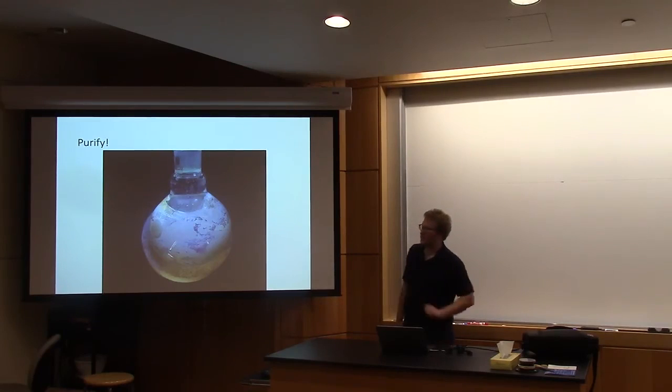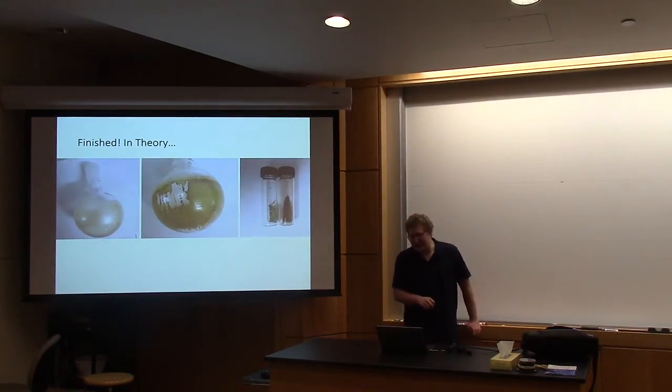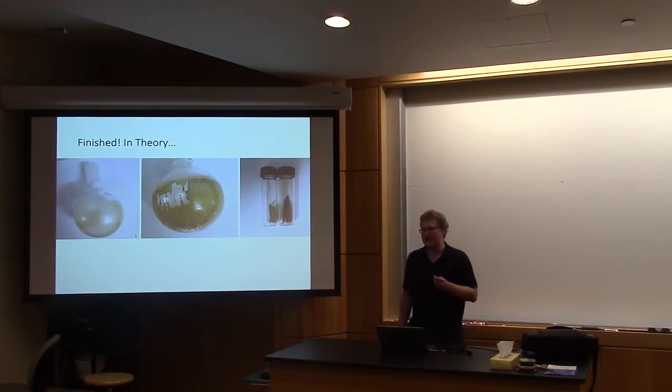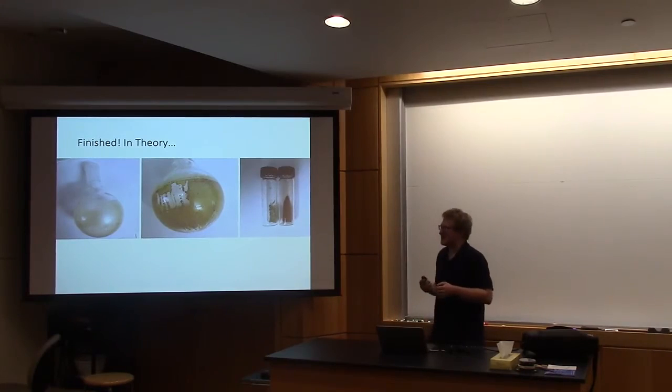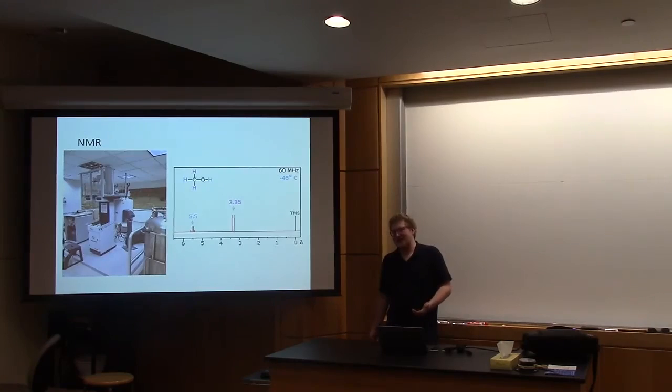So I needed to purify this. Unfortunately, I got a few too many things out of it. You can see that I got a pretty pearlescent powder, some sort of yellowish orange, a greenish powder, and a reddish powder that looked almost like rust. So the question is, which one of these is my product? The answer is none of them, sadly. As Frankly knows well.